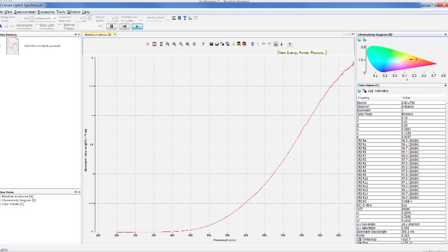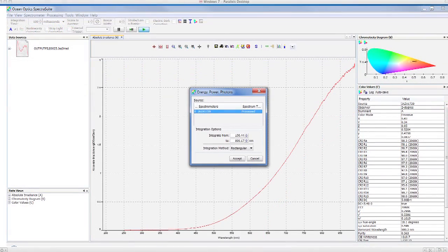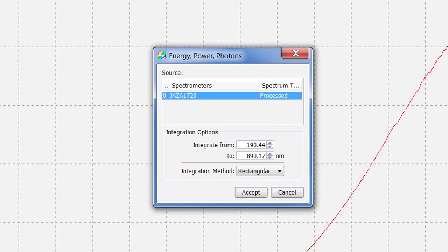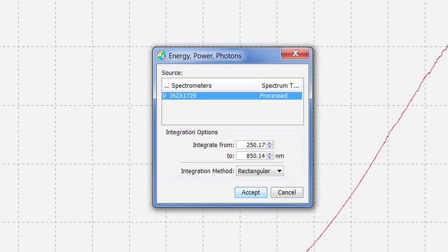Now we'll set up the radiometric measurement. Click on Energy, Power, Photons icon on the graph toolbar. You can select your integration range and choose from either rectangular, Simpsons, or trapezoid integration methods. We will integrate from 250 to 850 with the rectangular method.